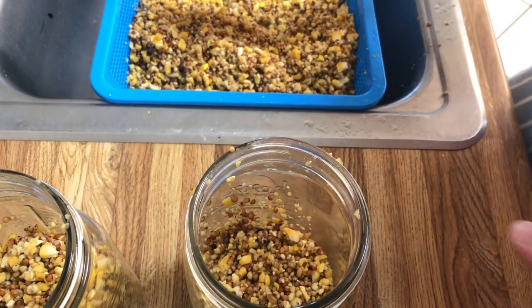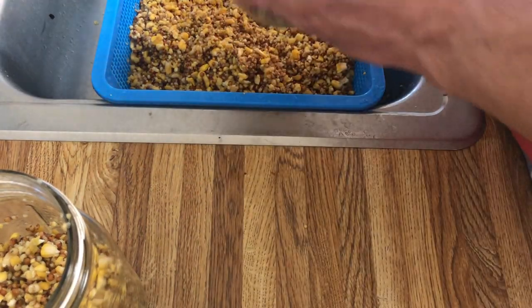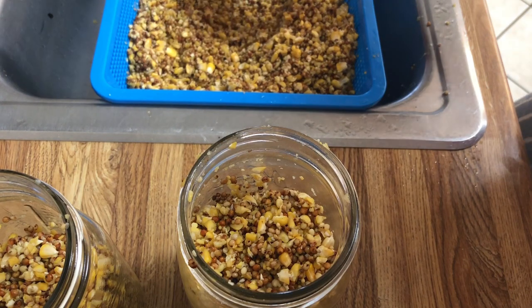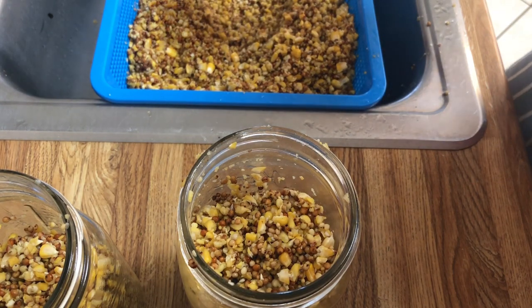If you're using liquid culture or you're dropping agar wedges in there, you can fill them up a little more. You know, you can fill them up to 60%, so 50%. And then once we have these full, we'll put them in our pressure cooker.